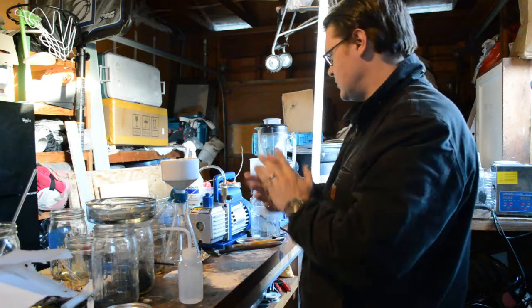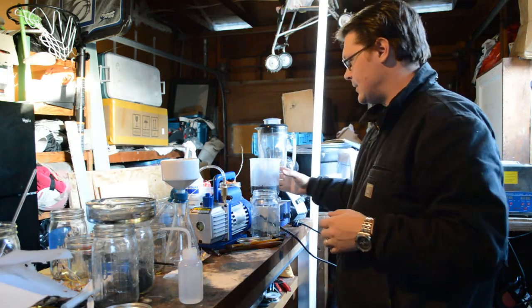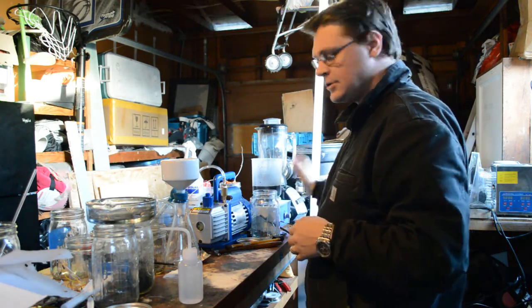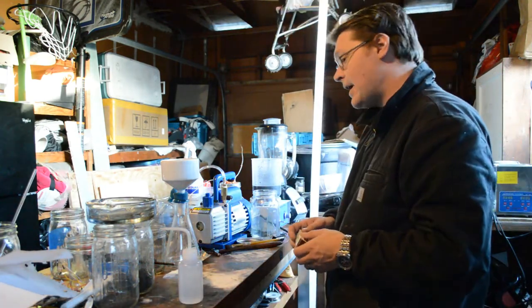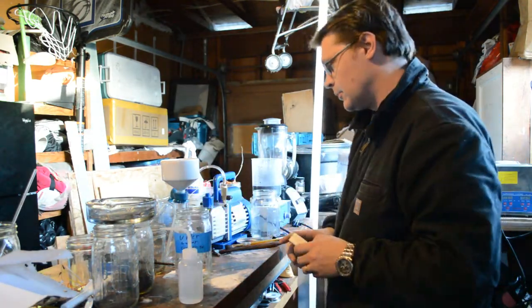Hey YouTubers. Today I am finishing up the first half of my graphene project. I got stuff on the stir right now that I'm going to shut off. This is a hydrogen peroxide solution. I set it up to dump the fine stuff in the upper layer of this graphite that we were separating on one of the previous videos.